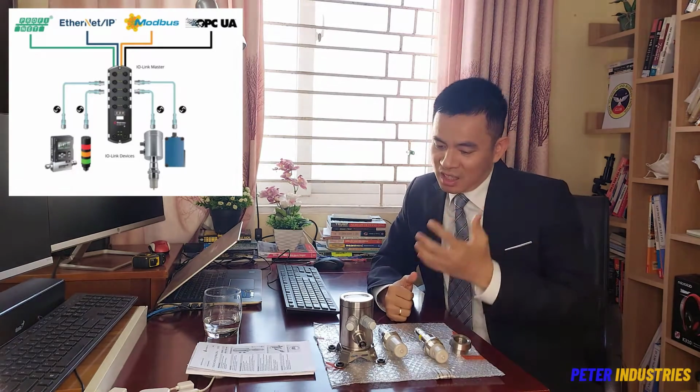And number 3, it is hybrid technology. It can use the traditional 4 to 20 milliamps, or it can use IO-Link communication to connect to the smart control system, exchange data, and it allows collecting the data even to the cloud. And number 4, very important, a 5-year guarantee. It is an excellent performance commitment from Anderson Negele.